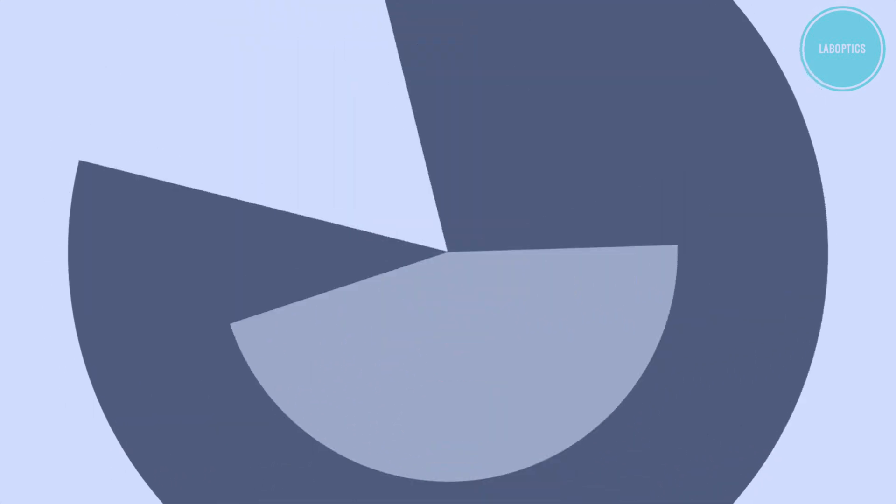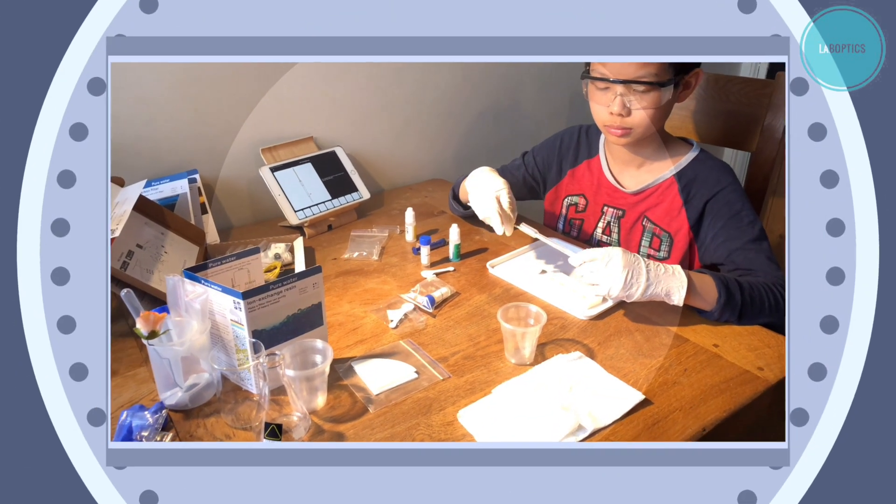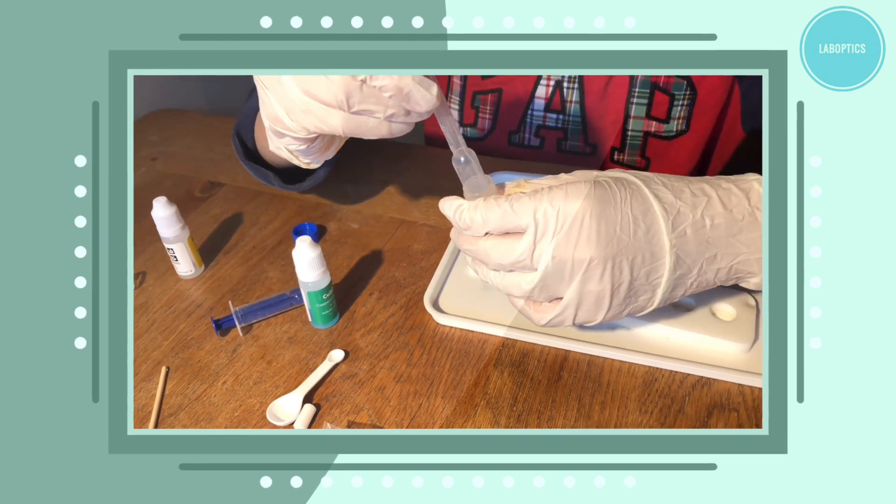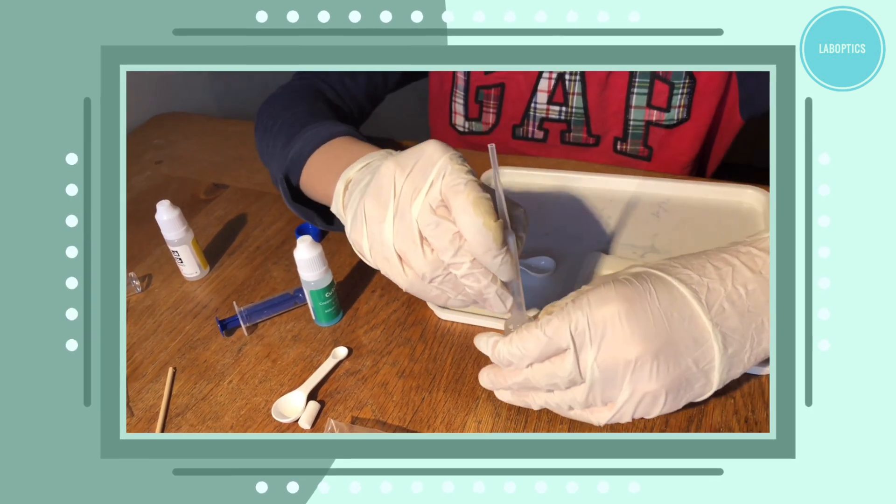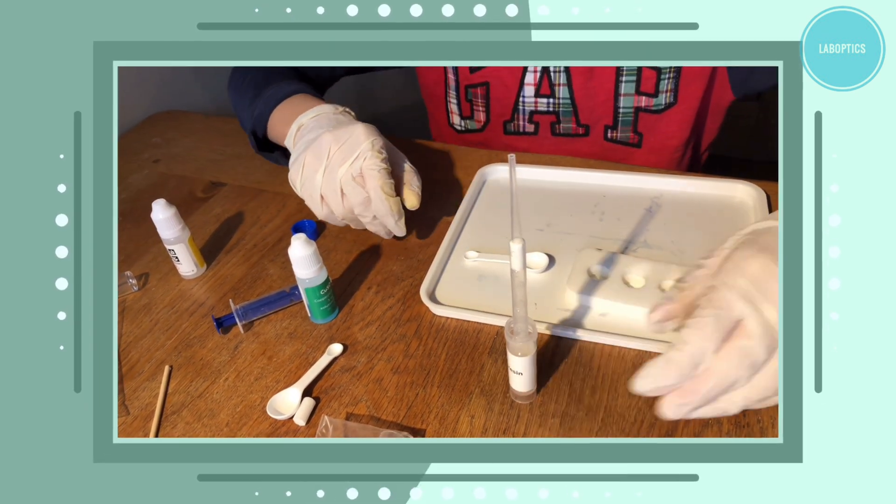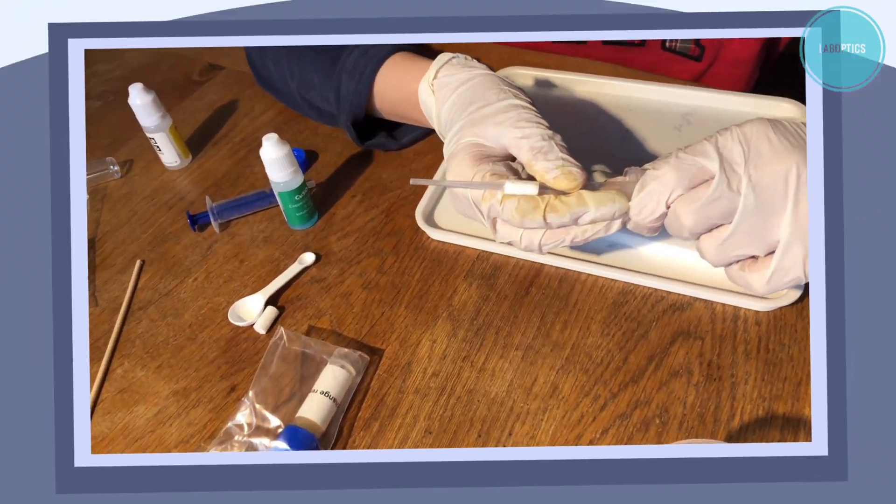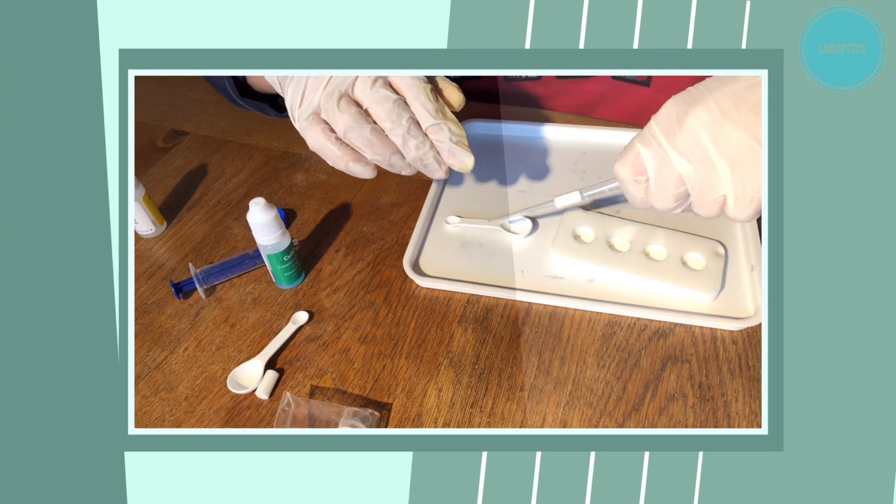Firstly we will insert a cotton cylinder into this cut pipette using a wooden stick. Then we will insert the wide end of the cut pipette into the vial of resin. After this we will tilt the cut pipette horizontally and then vertically to collect some of the resin in it.